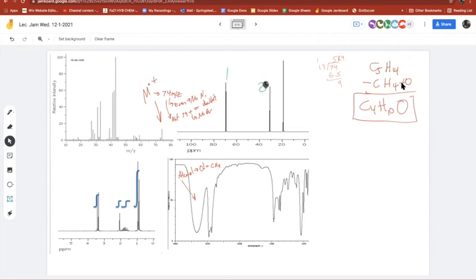I have 1, 2, 3 carbon signals for 4 carbons. I think that can happen because you have symmetry for the molecule. And also I see this proton NMR signal, this big doublet. That looks like an isopropyl group to me. And if I have 10 hydrogens and I decided to go like 1 hydrogen for this integration, 1 for this one, how many would this integration curve be if those other ones are 1?